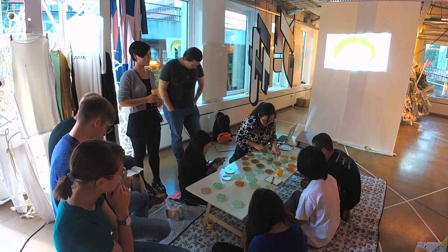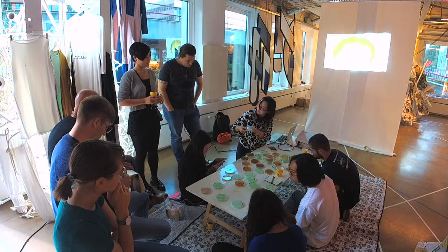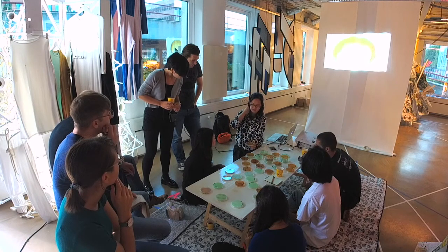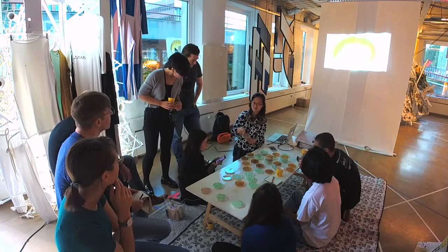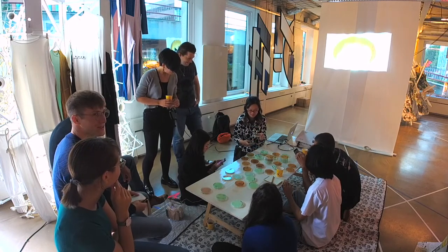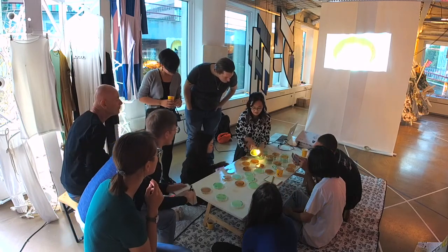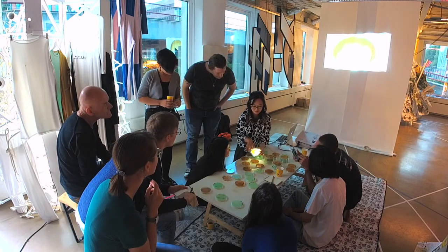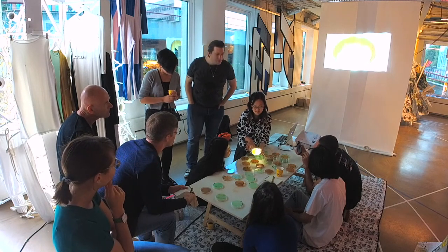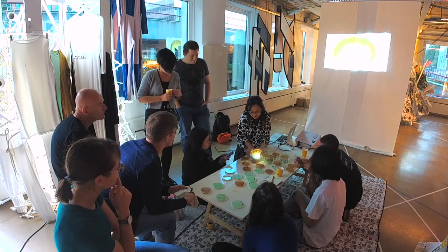So you can just come and check your own Petri dish. I wanted to ask what this one is, but she's not here. The Korean girl. I couldn't read these two Korean characters, but these are growing really well. I'm really curious what it is. Like, you see this one? Whoa. And this is sort of around this probably because we have a bit of condensation, so it's water that goes around. But this one is really good. And then this one's also really good.